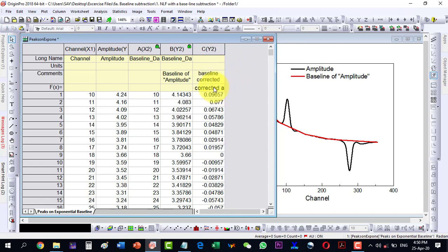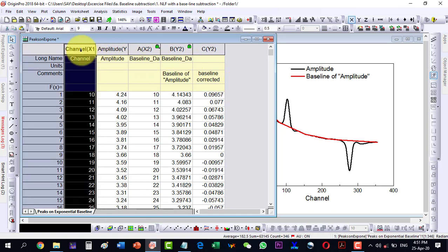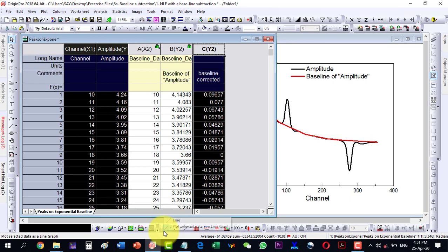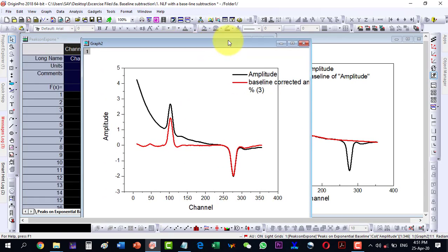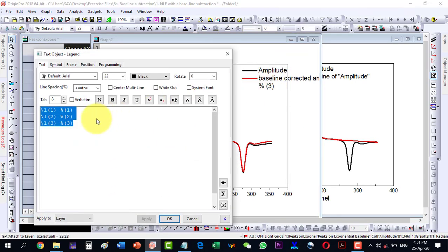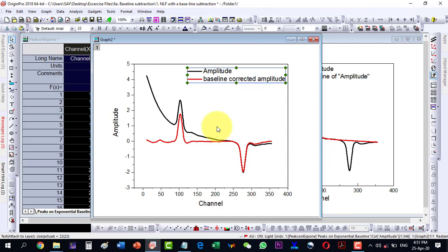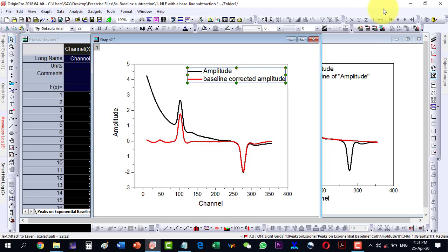Now I can plot both the actual amplitude and the baseline-corrected amplitude together. The resulting plot shows both curves — the actual amplitude and then the baseline-corrected amplitude. This is the first method: create a baseline and then subtract it manually.